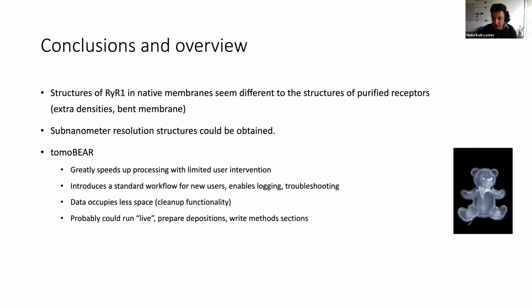Then I'm really proud that we built this little system. We'll want to try to release it. It improves processing time, and it also introduces an in-the-lab standard where I, as a PI, can go and see what the person is actually doing, and colleagues can also exchange experience. It's easier to troubleshoot. Tomography occupies a lot of space, and here we have a functionality to actually clean up the unused intermediate steps. It has the potential to run live in principle.